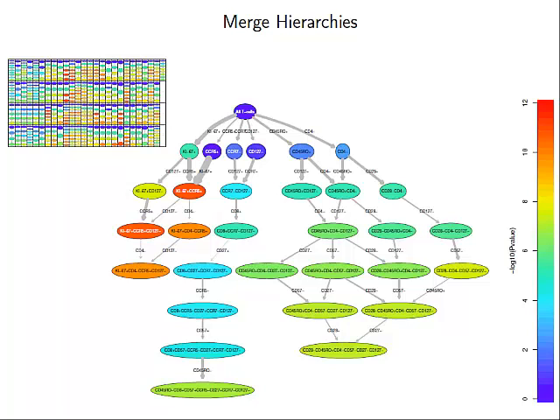So the corollary of this, if that's the right word, and it's a really good example of where CyTOF becomes useful, is you do a big fishing expedition, throw in as many markers as you can possibly afford, because you don't know what's going to turn up. Then you find the one population or two populations that are really interesting that use a few markers. Now you don't have to do CyTOF anymore. You've done that whole fishing expedition. We say this is the population that's really interesting to you.